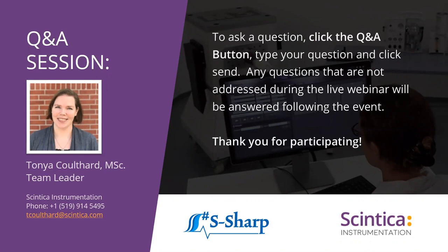Sure. So for those who are more advanced in terms of the physics use, and I see a question around detecting fatty liver disease from Michelle Hempkins. Typically at that point, you're looking at very detailed information about the exact frequencies of sound that are coming back and the brightness and the intensities. It may be that you need to look deeper into the data, and so the system comes with raw data export capabilities for you to be able to do that, which would probably be the most appropriate way for you to look specifically for fatty liver disease, because that signal is going to come back much brighter, as fat does reflect the sound much more strongly than the liver parenchyma.